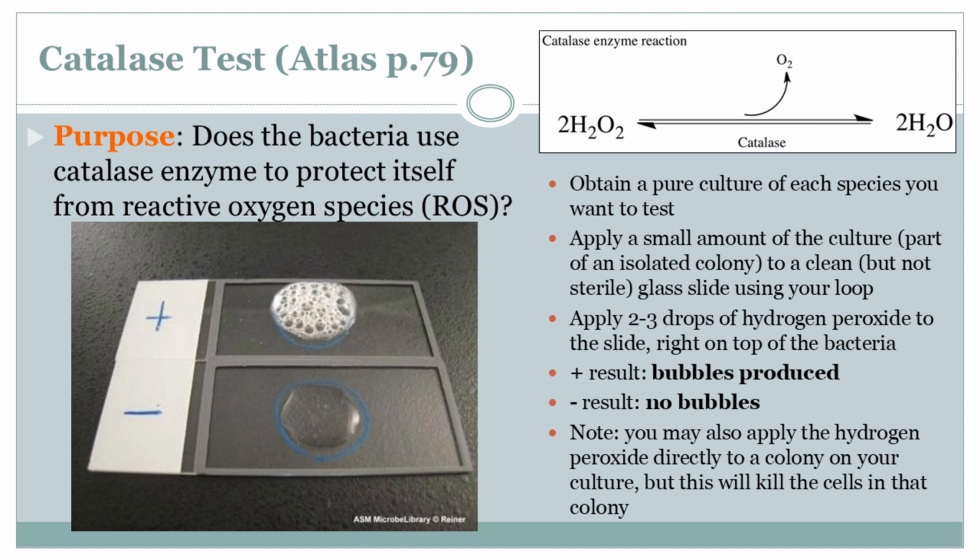But what if there are no bubbles? What does that tell us? Well, it could point to an infection caused by bacteria that don't love oxygen so much. They don't produce catalase, so no bubble party for them. The PDF source actually gives a good example of this. Enterococcus faecalis. That's a mouthful. Yeah, it's a bit of a tongue twister, but it's actually pretty common. Lives in our gut, usually doesn't cause any problems there. So Enterococcus faecalis, our gut buddy, no bubbles for that one because our gut doesn't have a ton of oxygen just hanging around, right? Right. It's adapted to a lower oxygen environment.